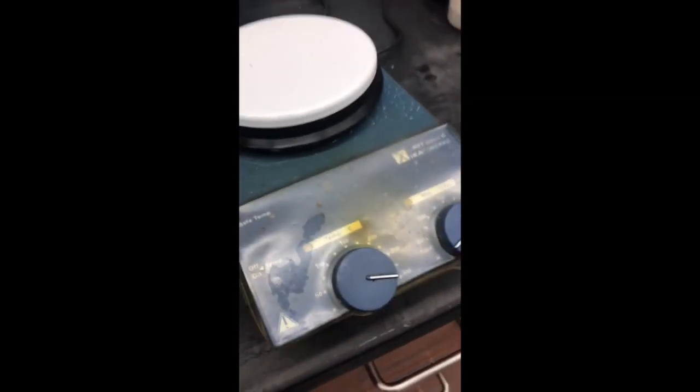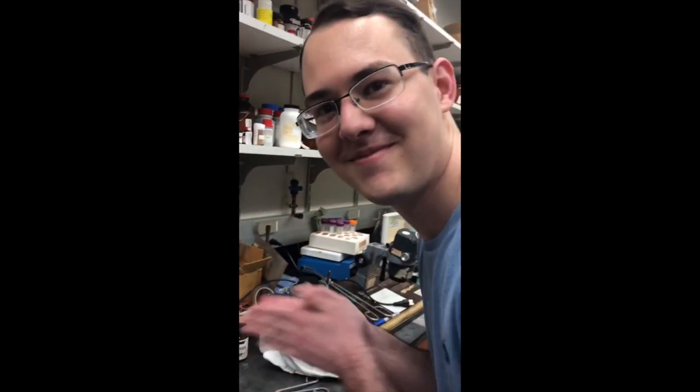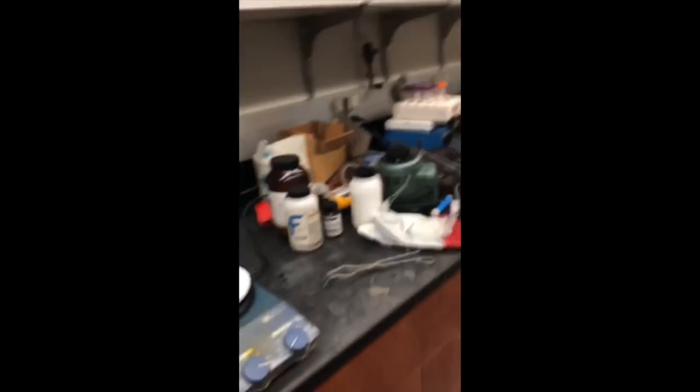Don't leave the lab if you have a hot plate on. Don't increase the hot plate's temperature to speed up your reaction. Use the temperature recommended by the instructions for the lab.